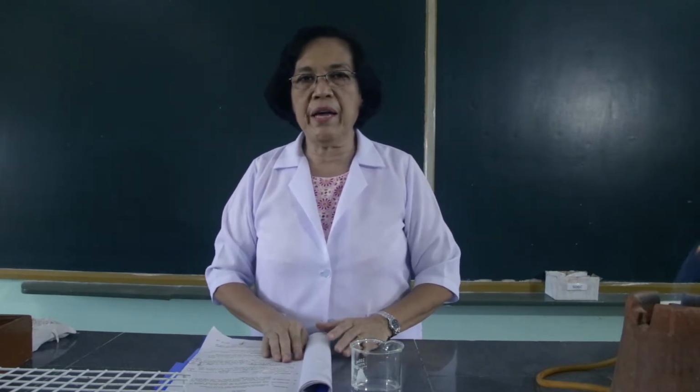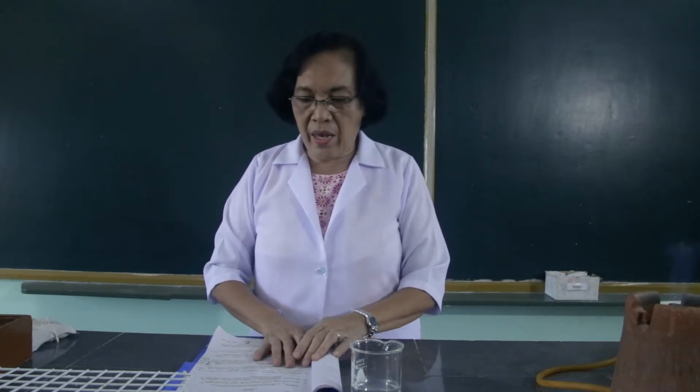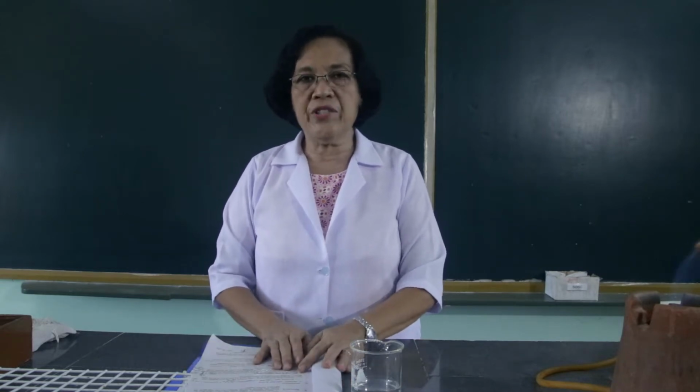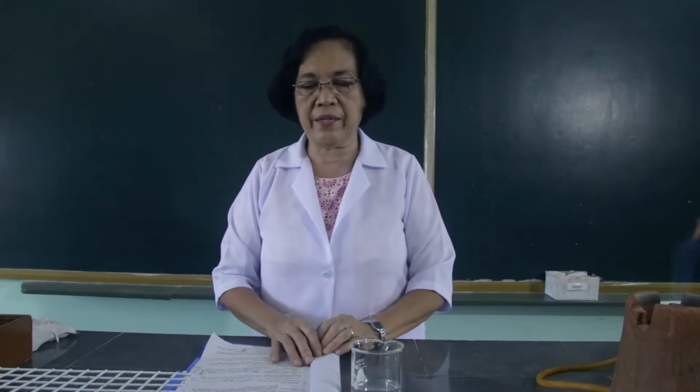Today, I will be demonstrating to you an experiment on blood. The purpose of this experiment is to determine the different constituents of the blood and to differentiate oxyhemoglobin from reduced hemoglobin. For the first part of the experiment, we have a general test for the blood. And the general test applied for the blood is the benzidine test.